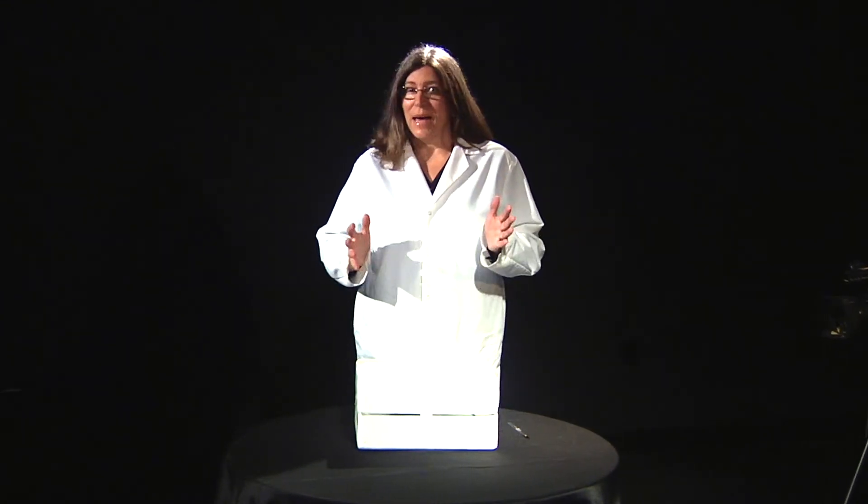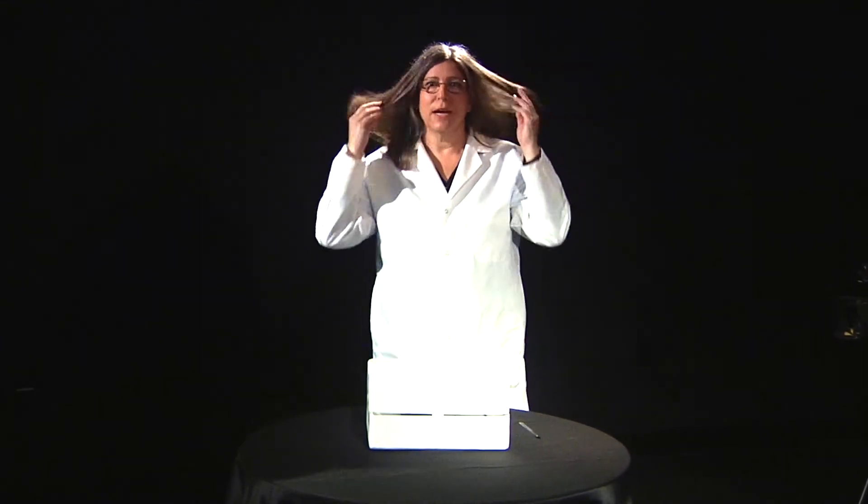But first, this is a lab, and my hair is pretty long and it's down. It needs to be put up, so I should take care of that really quickly.